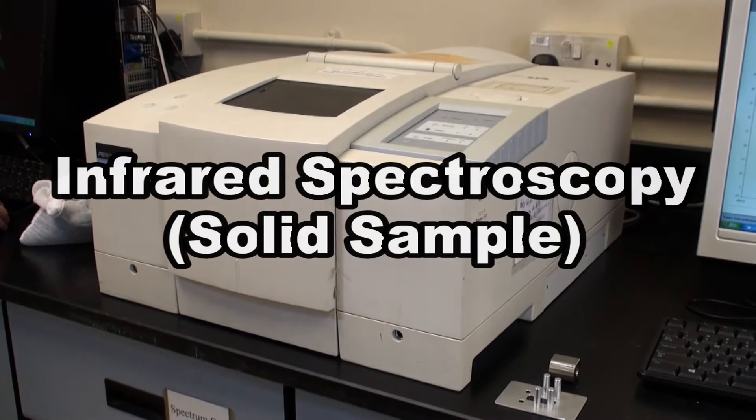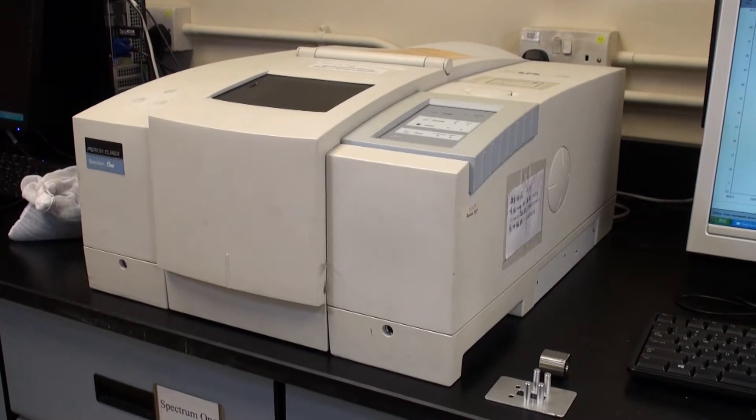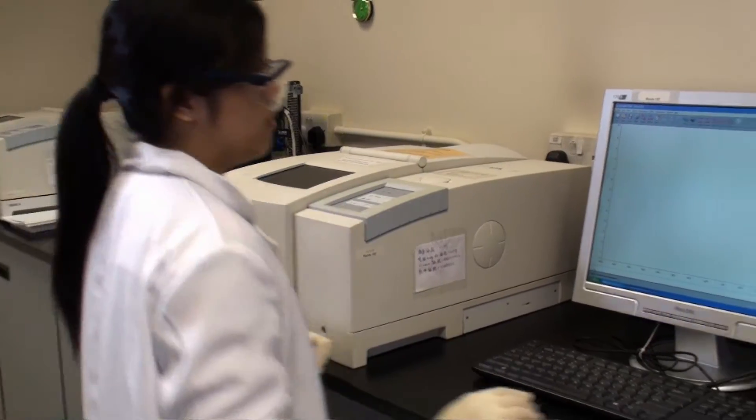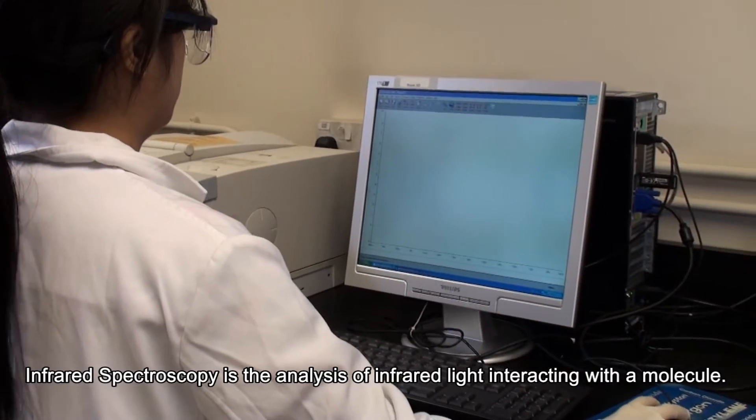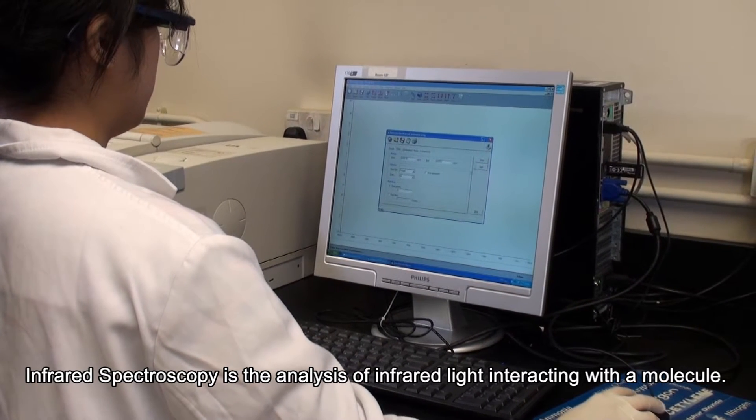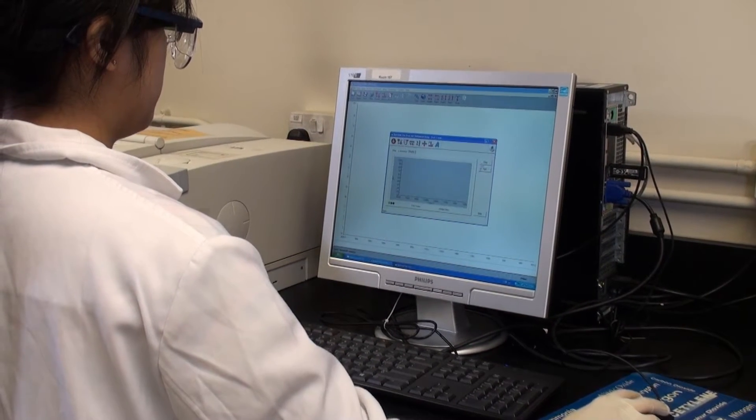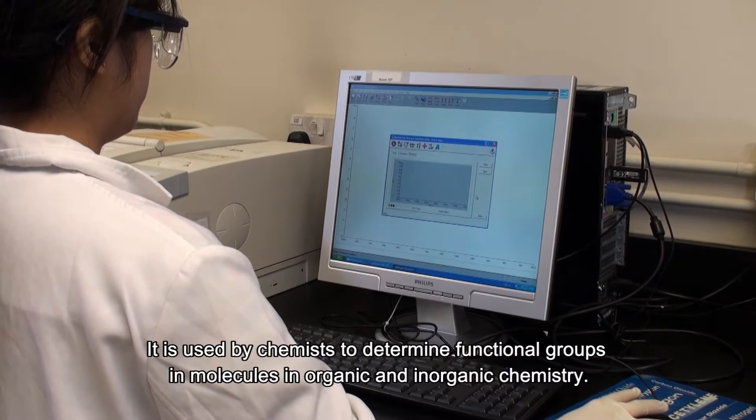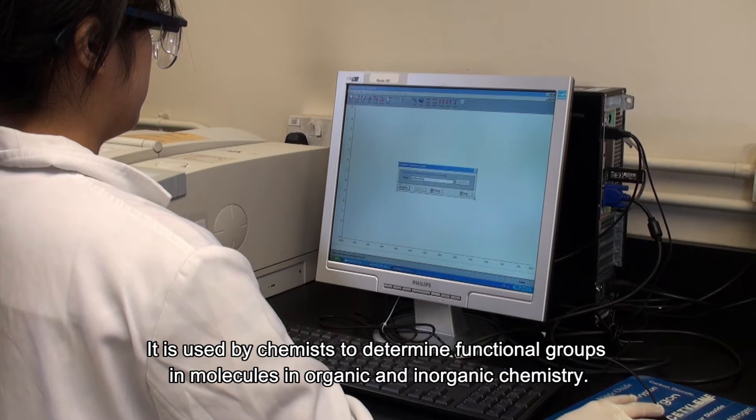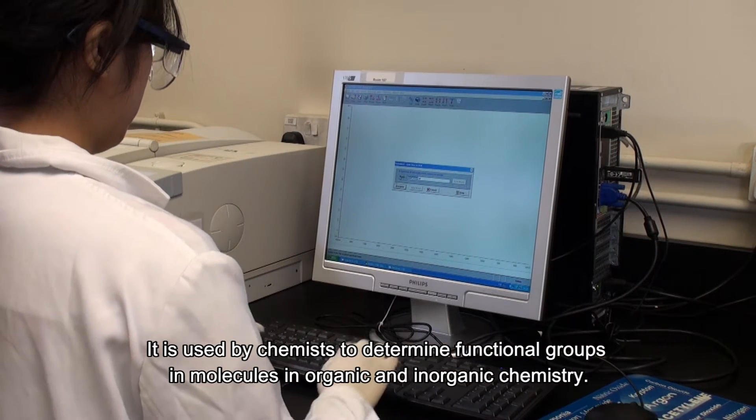Infrared Spectroscopy Solid Sample. Infrared spectroscopy is the analysis of infrared light interacting with a molecule. It is used by chemists to determine functional groups in molecules in organic and inorganic chemistry.